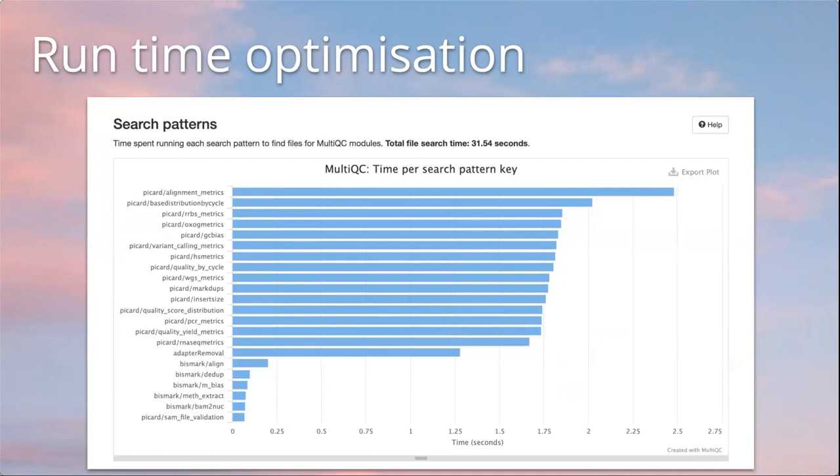In the log, it will tell you how long it took to run and how long it spent doing different things. In this example here, you can see the vast majority of the time was spent looking through the different files trying to find which ones are relevant. Within a MultiQC report, you get plots which tell you how fast or slow different search patterns were. MultiQC has a bunch of different ways to find relevant input files. The simplest is by a file name pattern - if a tool always gives the same suffix for its output files, they're easy to find. But many, if not most tools, don't do this. MultiQC has to look within the file contents to find those files, and that can be a bit slow. Picard here is one of the worst culprits - it's got lots of different outputs it can find, so there's lots of different search patterns.